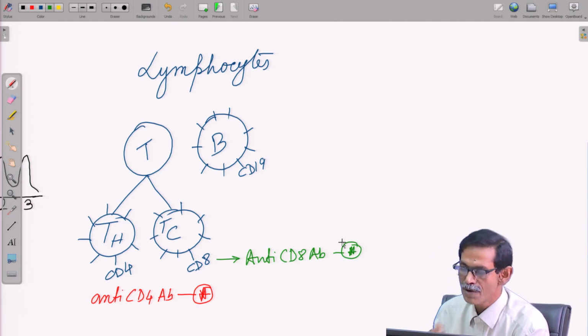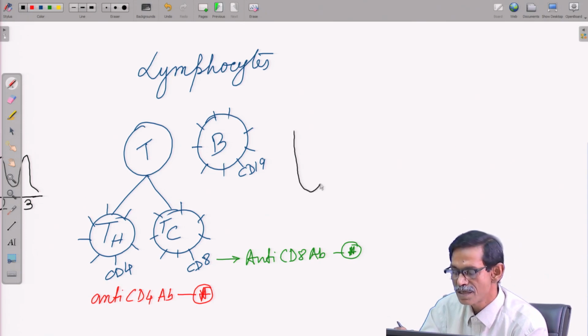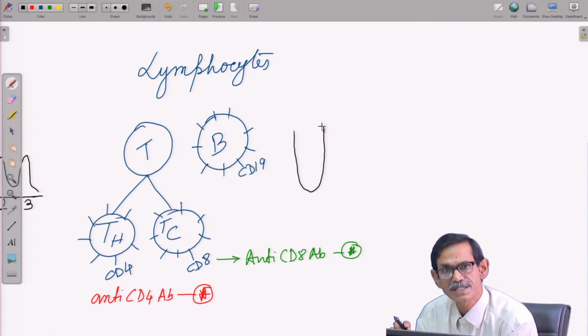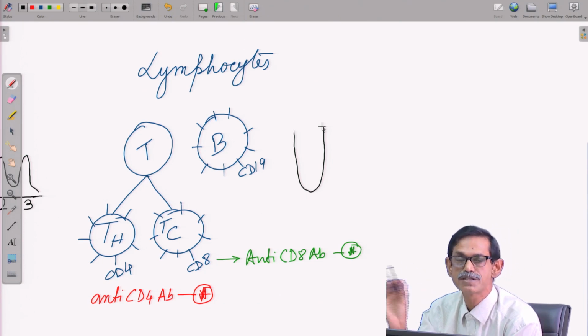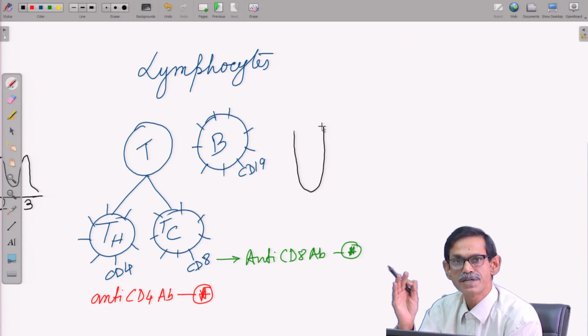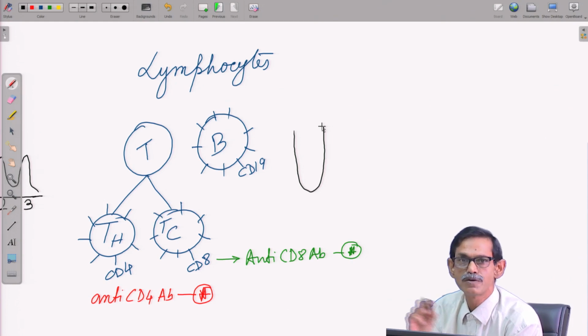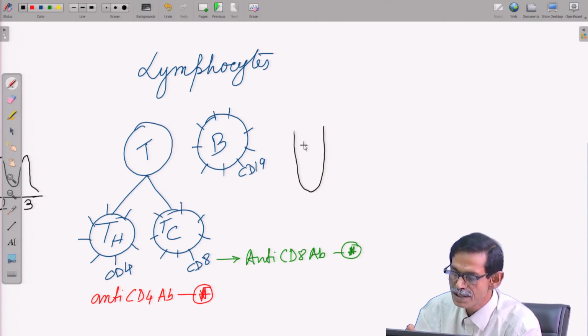Okay. So, now if I take blood, where all the lymphocytes are there, or if I take cells from spleen which is loaded with B cells and T cells, not blood say. I isolate the spleen and from the spleen I isolate the cells. So, that will be loaded with B cells and T cells. Okay. So, all B cells and T cells will be looking the same. So, you cannot distinguish which one is what. Okay.